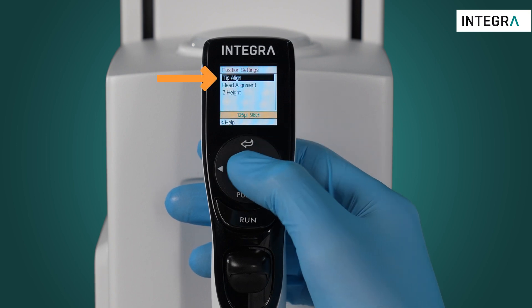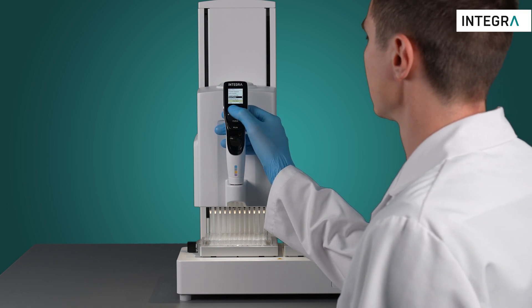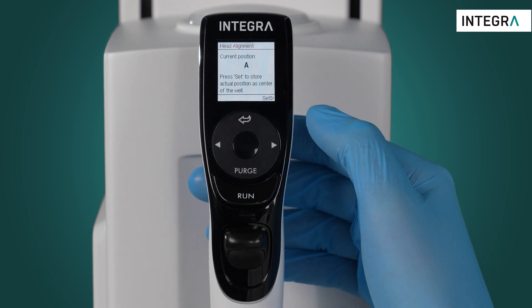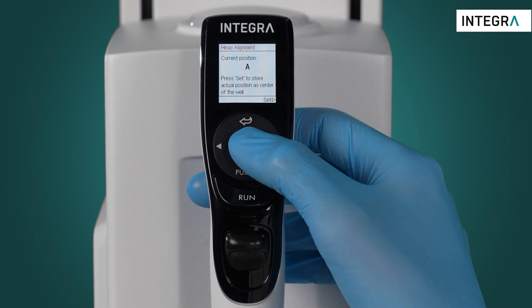This is called tip align, but before this is activated the instrument needs to be taught where the center of the wells is. This can be done by entering the head alignment. In this menu you can teach the instrument exactly where you want it to guide you when you activate the tip align.